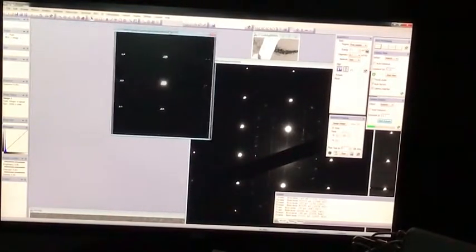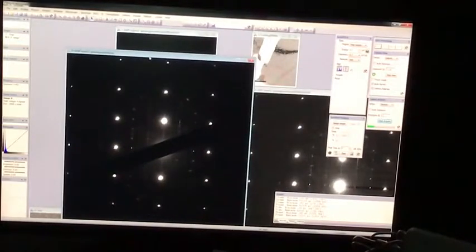Okay, I'm going to close these, but these have a lot of interesting information in them. You can see the main matrix spots, so these are due to the aluminium matrix, and these are most likely due to something else, which you should realize what that is from lectures. But I'll tell you now, it's from the precipitate phase that occurs within this alloy. Okay, the dominant precipitate phase.